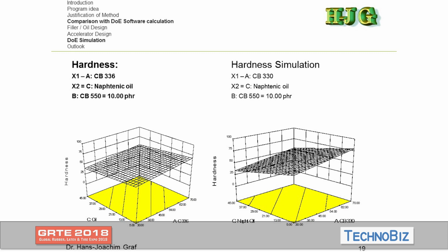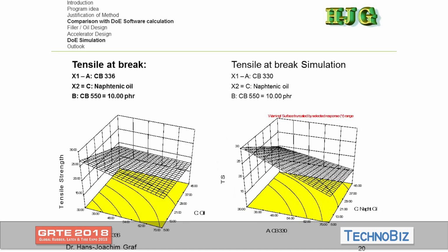And when you see the tensile break, and you look here in the edges, you see that the data are pretty close. Even the measurement error on tensile is a little bit larger than all the other measurements. So if you see that really there is a type of onset, and that is obviously because the old database used their standard Malaysian rubber, and the people here replacing that by standard Thai rubber.